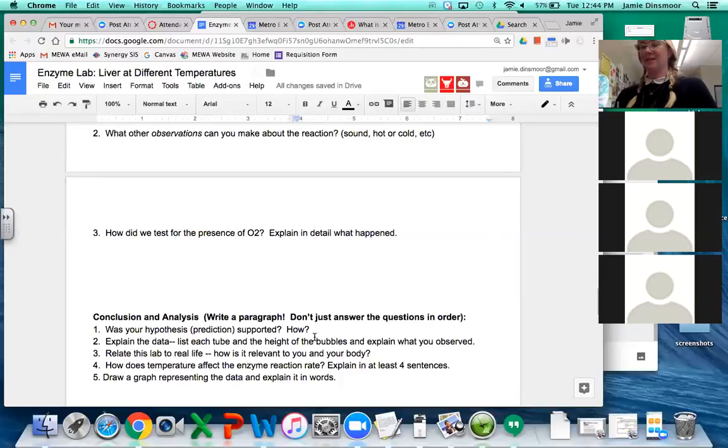All right. Let's make sure this is going to work first. Okay, getting it on camera too. Okay, we got fire. We have reaction. Ember. Come on. All right, when it does do it, it's going to be really cool, but it might take a second here. Come on. Maybe it went out. Nah, it just has to get enough oxygen. It's fine. Keep doing it until it works.